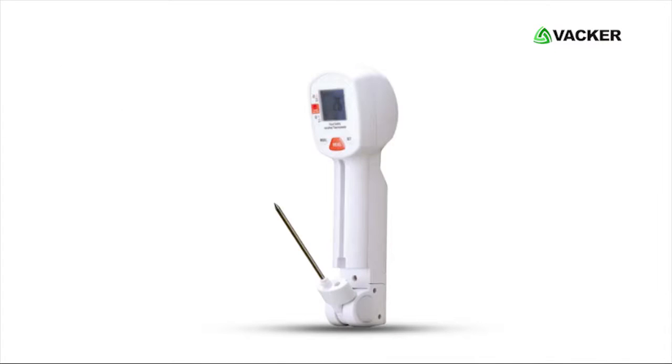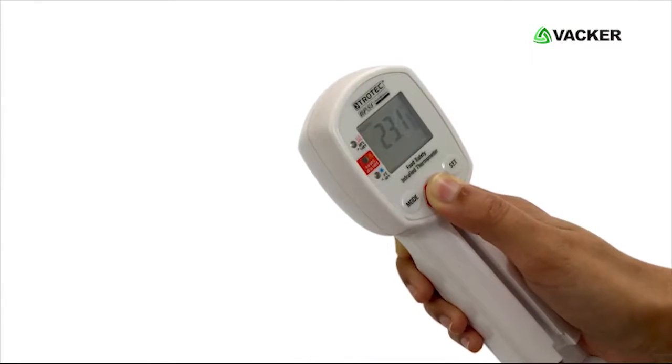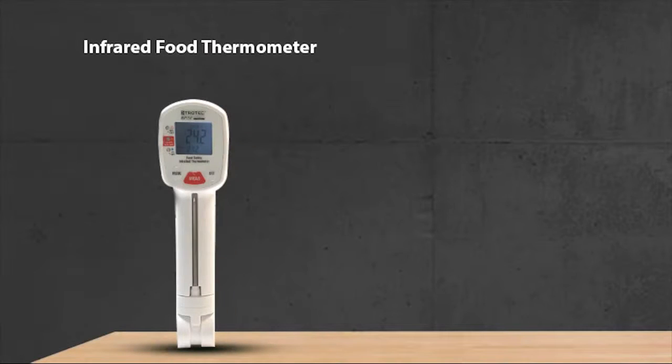Using the probe thermometer: press the temperature probe's lock and fold out the temperature probe. Insert the probe into the food. Press the Meas button continuously to obtain the temperature of the food.